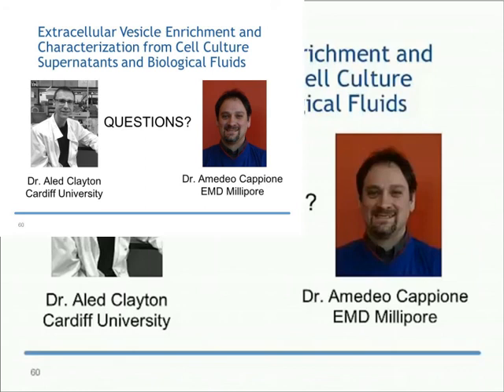All right, next question. At what safety level do you work with immunogenic particles? Yes, I think this question relates to the possibility of viruses in vesicle preparations, and certainly if you have a source of vesicles which contains infectious virus, there's every possible chance, if you just do a simple pelleting type of protocol, that you're also concentrating viruses with your vesicles. So this is a really important consideration for people working with HIV or CMV or other infectious viruses like EBV, for example. There are methods available that may help you sort and separate virion from vesicles.